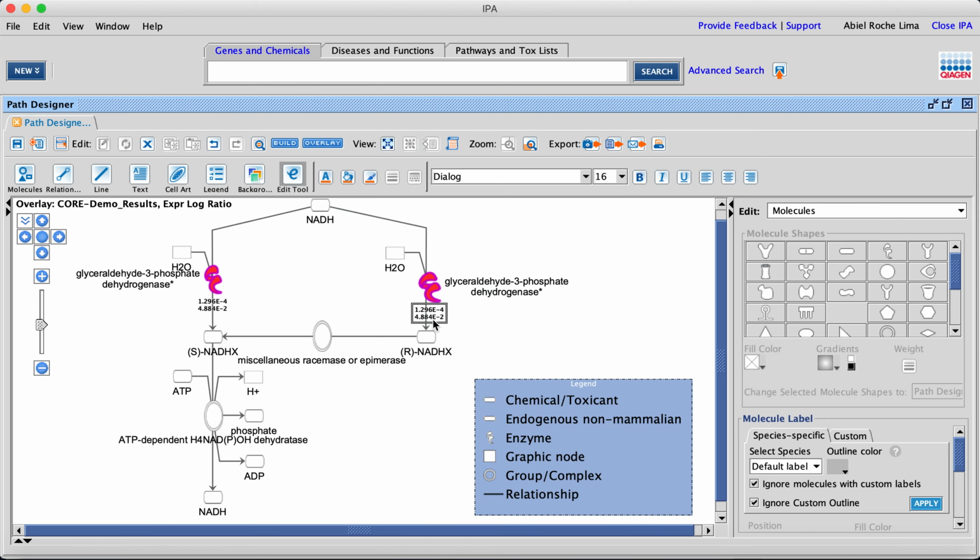You can change as well the size of the values represented in each one, and so on. So there's plenty of options for you to edit pathways, and not limited to pathways, but networks as well. So the one that we previously discussed using the network interactions, we now can as well edit that network in here.